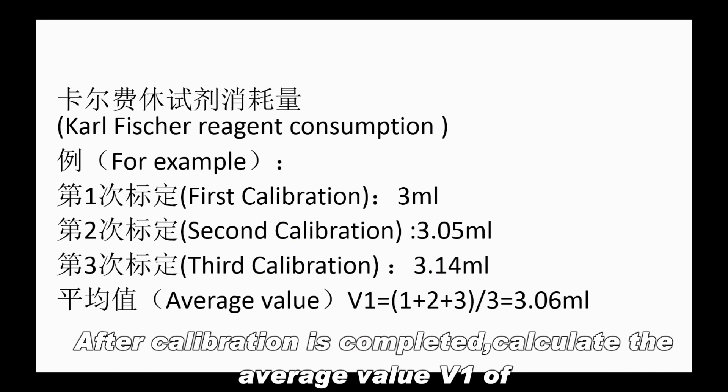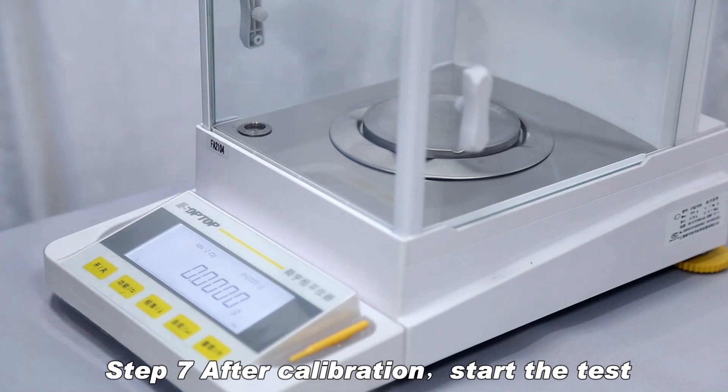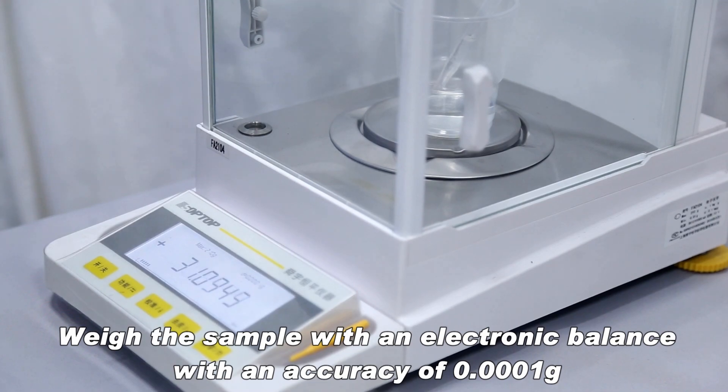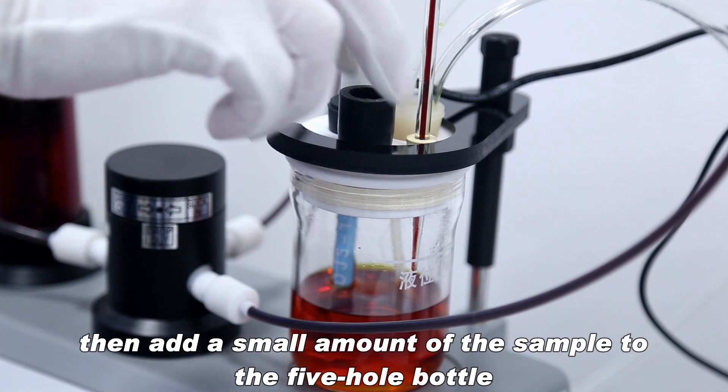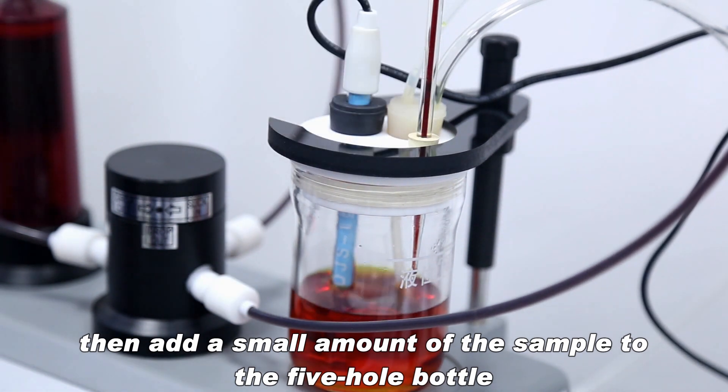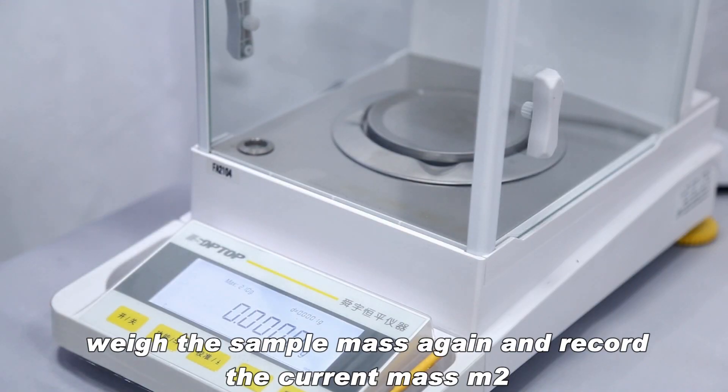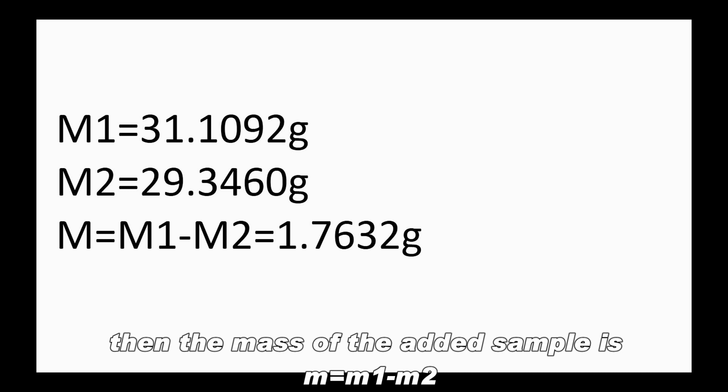After calibration is completed, calculate the average value V1 of the amount of Karl Fischer to be consumed by titrating 10 µL of pure water. After calibration, start the test. Weigh the sample with an electronic balance with an accuracy of 0.0001 grams and record the current mass M1. Then add a small amount of the sample to the 5-hole bottle. Weigh the sample mass again and record the current mass M2. Then the mass of the added sample is M equals M1 minus M2.